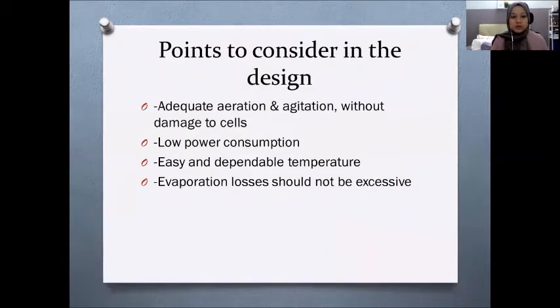So what are the points to consider in the design? There are many points to consider in designing a bioreactor, so this is just 4 of them. The first one is adequate aeration and agitation without damage to the cell, low power consumption, easy and dependable temperature control, and evaporation losses should not be excessive.